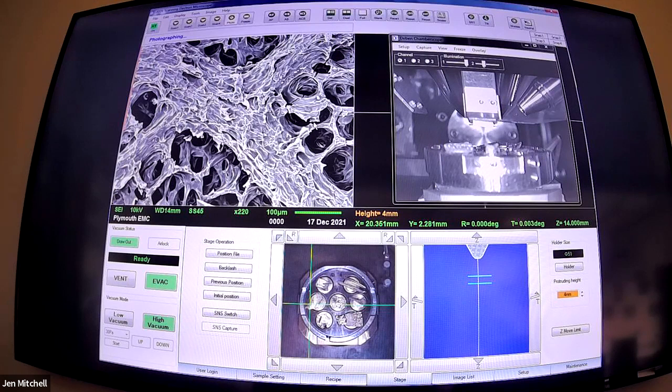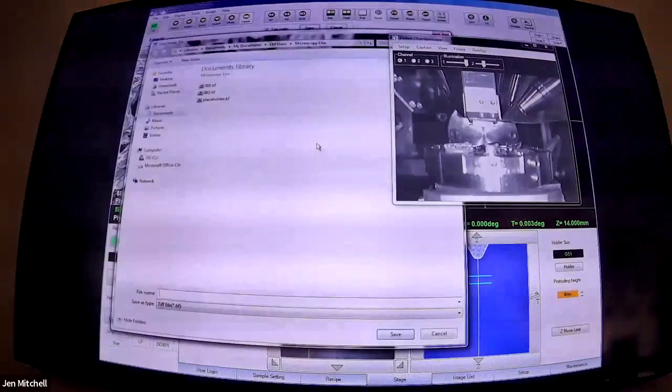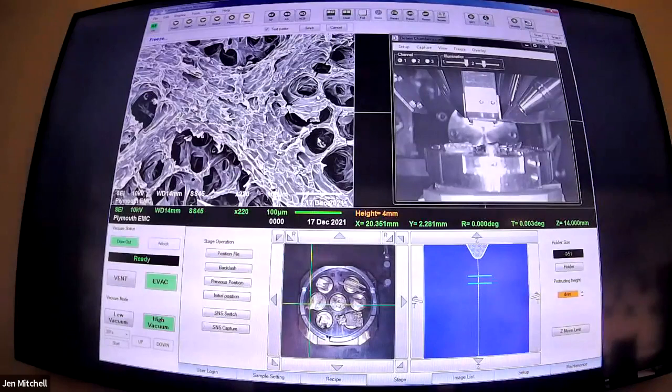The photograph's on a really slow scan speed so we can get lots of detail in. This one's quite handy because it has a little orange bar that tells you how far it's got left to go. The microscope we've been using, our 7001, doesn't do that - you just have to wait and eventually it'll tell you it's finished. So this one's actually quite nice and user friendly. What's happening is the beam is just dwelling longer in each spot, in each pixel, so you get more signal relative to the noise. It just looks a lot smoother.